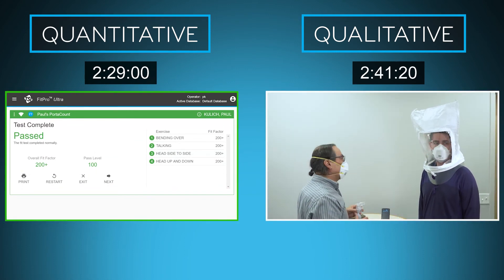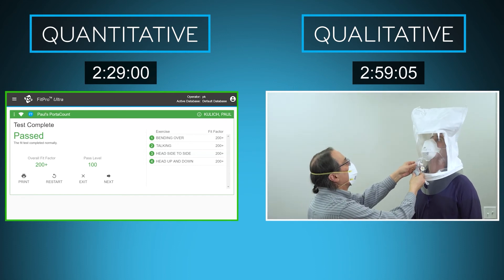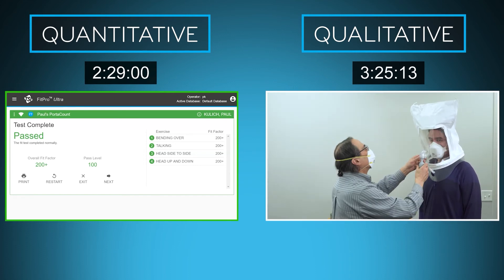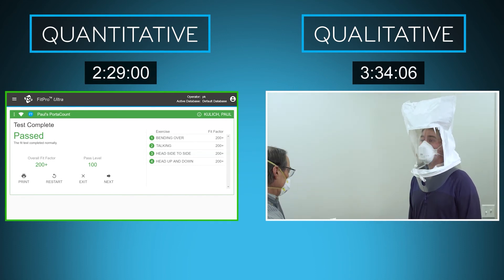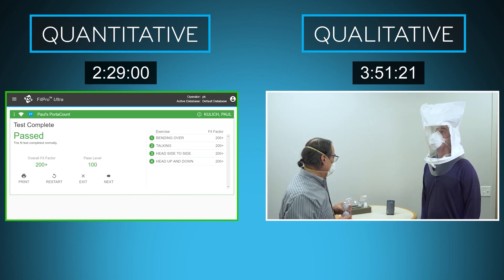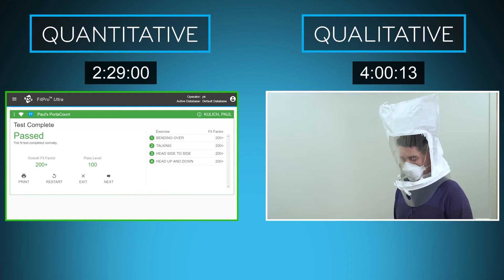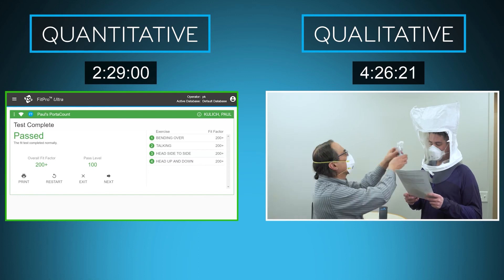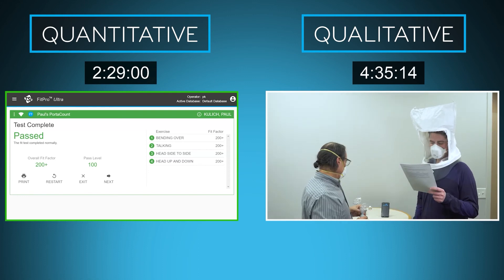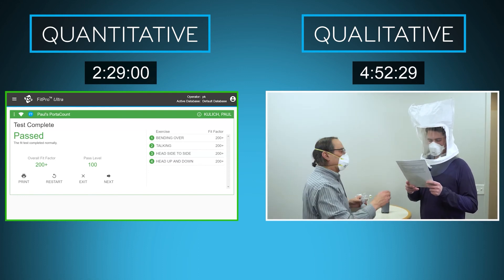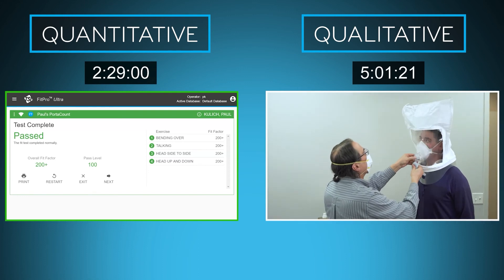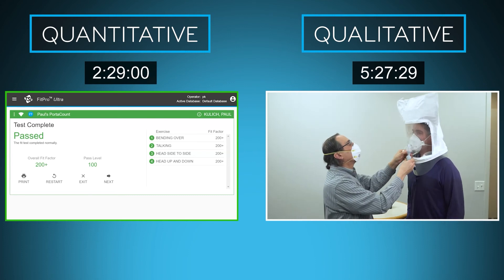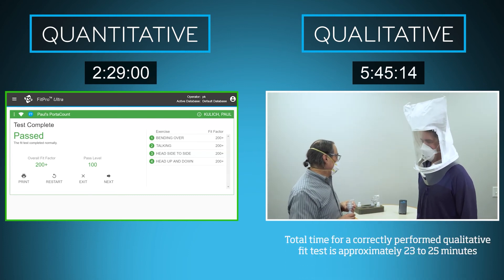The qualitative fit test still needs to complete the third exercise, followed by another four exercises: a minute each of head up and down, talking, bending over or jogging in place, and normal breathing. Keep in mind the fit tester will need to squeeze the nebulizer 10 to 30 times at the beginning of each exercise, and then half that amount every 30 seconds.